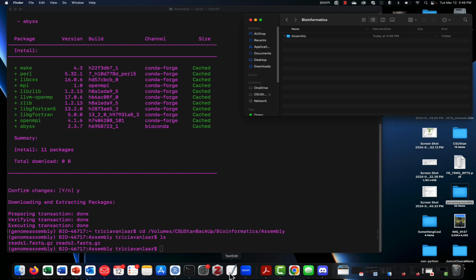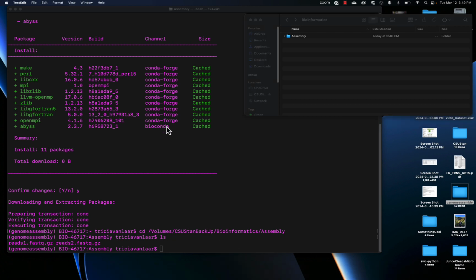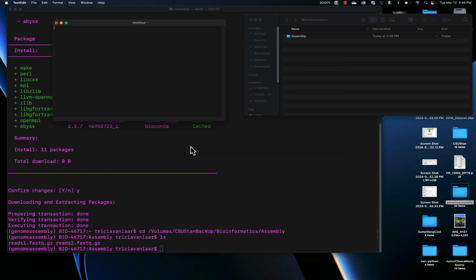For other people, it didn't work quite as well, but what can work is if you type, at your prompt in your shell, cd /mnt/d.